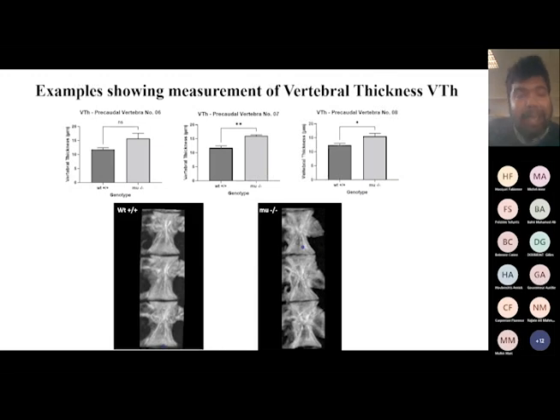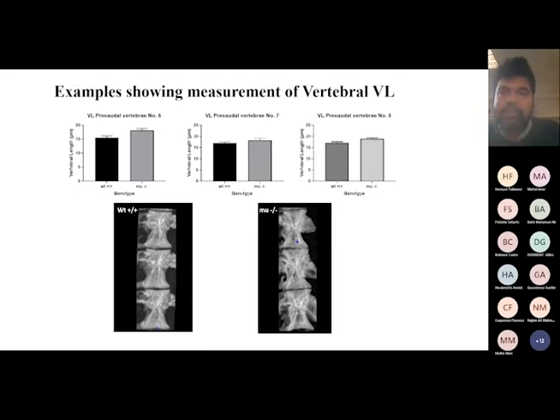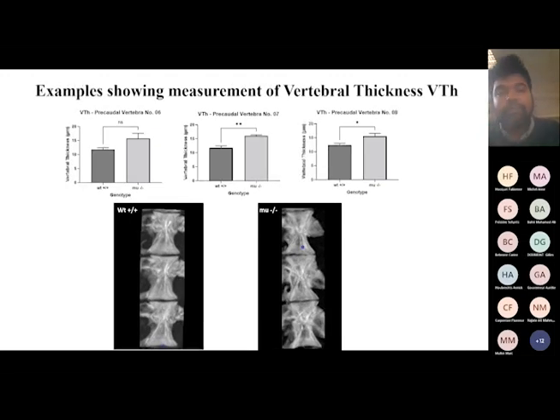And then you can perform the analysis comparing the control and the mutant, because when you are going to have a study, like in the case of my project, you are looking at a control and a mutated zebrafish, because we are trying to study the role, as I said earlier. So it is always important to have your control fish and a mutated fish to get a better understanding of the skeletal morphology and looking at the element up close, which is possible using X-rays or micro CT. So this is one example showing the measurement of the thickness and here of the length.